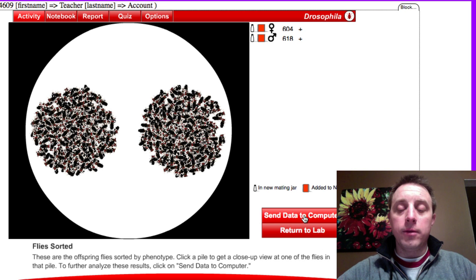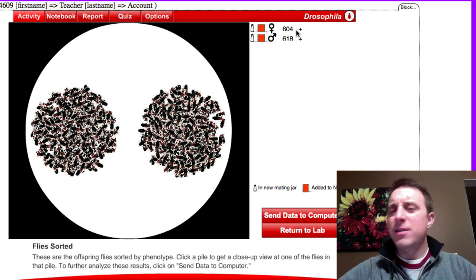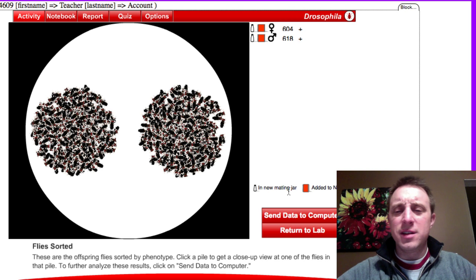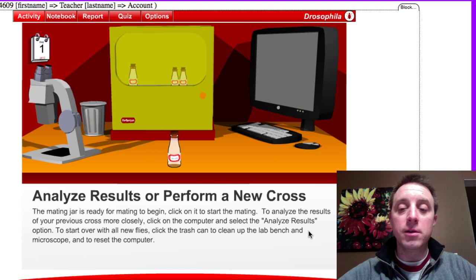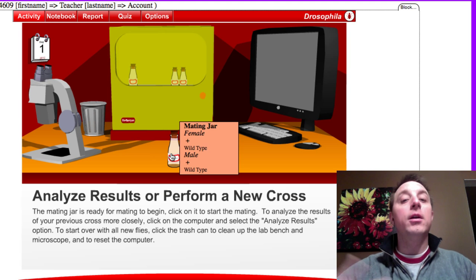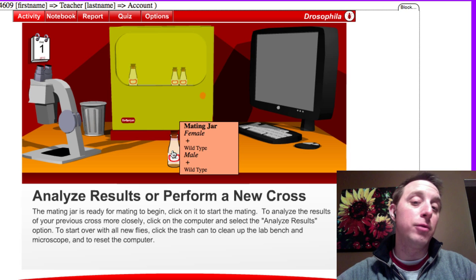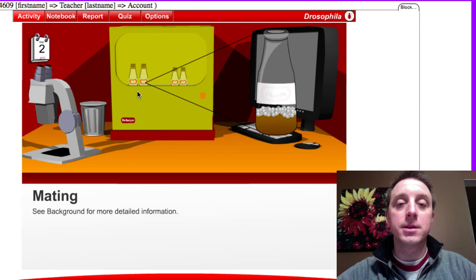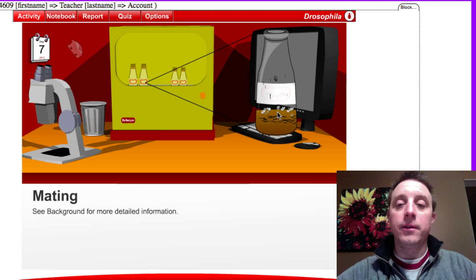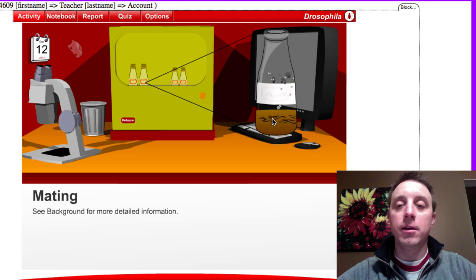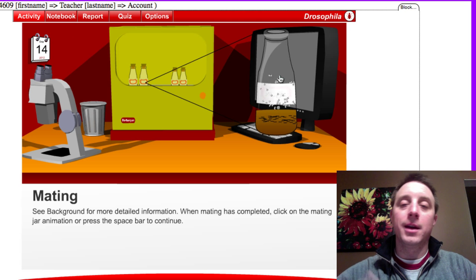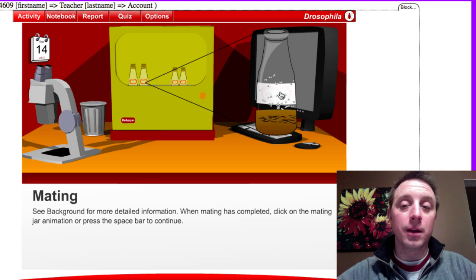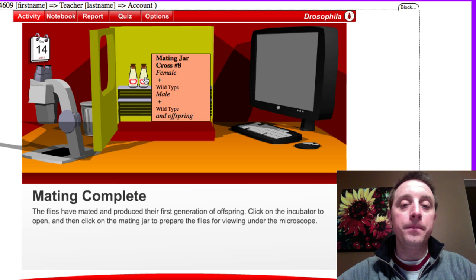Zoom back out. That will give us the look at both of the piles. These are all the males and not surprising, these are also wild type. We'll add him to the notebook and we'll also grab one of those males and put them in a new mating jar. Zoom out from this screen. We can send that into the computer. Since everything is wild type, it's really not all that interesting so we're not going to worry about sending it to be analyzed at this point. Return to the lab. Now we have our new mating jar, female wild type, male wild type. Remember these are the F1 generation. Back in the incubator, you can see the life cycle here, the eggs are hatching, the larva crawling around.